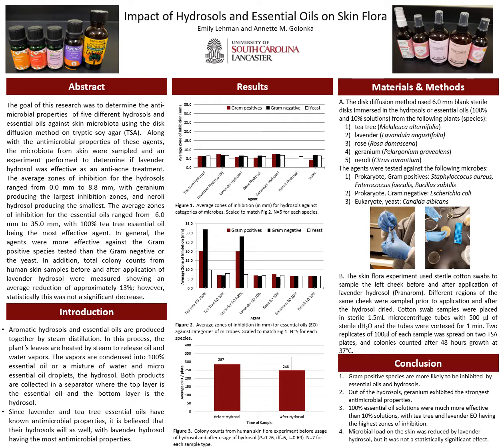The second experiment I ran was a total colony count experiment, where I was able to collect samples of skin flora before and after I put on the lavender hydrosol. I plated those samples on TSA plates, put them in the incubator for about 48 hours, and after that I counted all of the colonies on the plate. In figure 3, it shows you the average before putting on the hydrosol and the average after putting on the hydrosol.